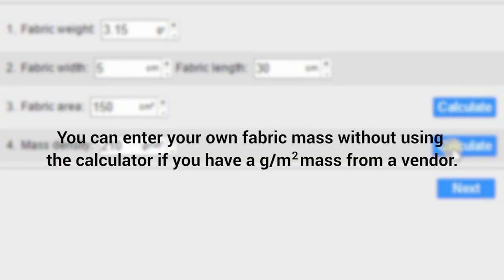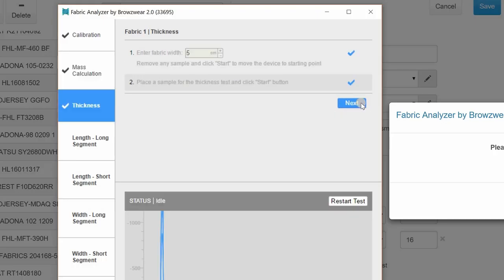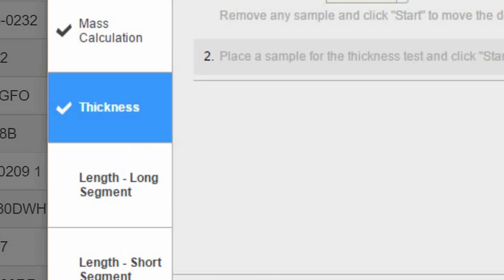Alternately, you can enter your own fabric mass without using the calculator if you have a grams per meter squared mass from a vendor. Click Next to start the following test. As you can see, the Thickness Test section is now highlighted.